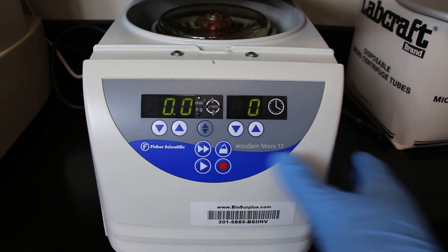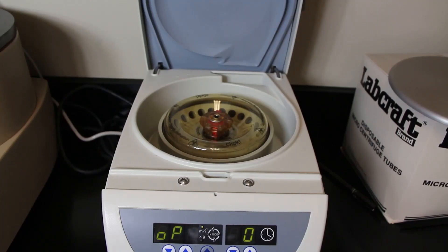Now open up the centrifuge and when you open it up you're going to see there's a little disc inside. It's a little plastic disc and there's a red button on that disc. That disc is there to make sure that the microcentrifuge tubes stay in place when it's spinning.